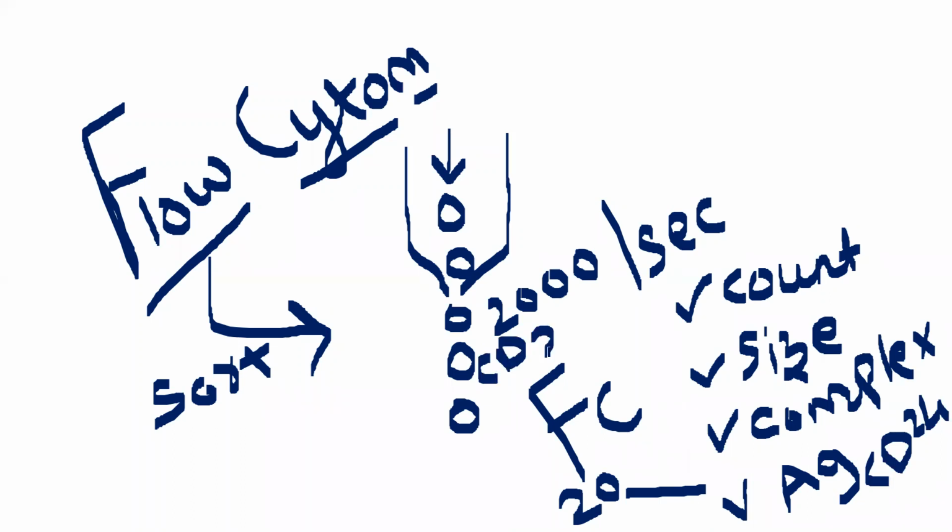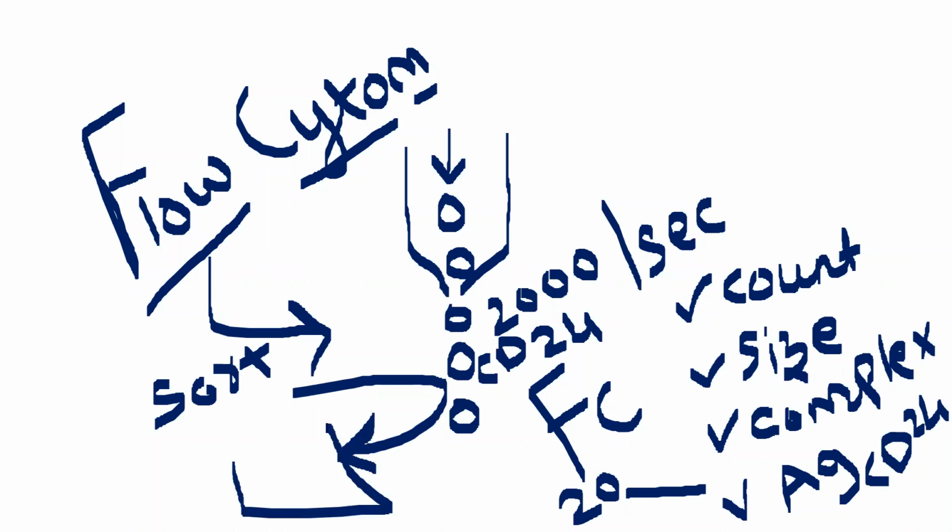My computer detected the CD24 cell. So when it is in motion, and it is detected by the flow cytometer, if it is a CD24 cell, this CD24 cell will be filtered into a basket. So now I can get only the specific CD24 cells into my basket. So I can even sort the cells. Sorting of cells is possible by this flow cytometer.